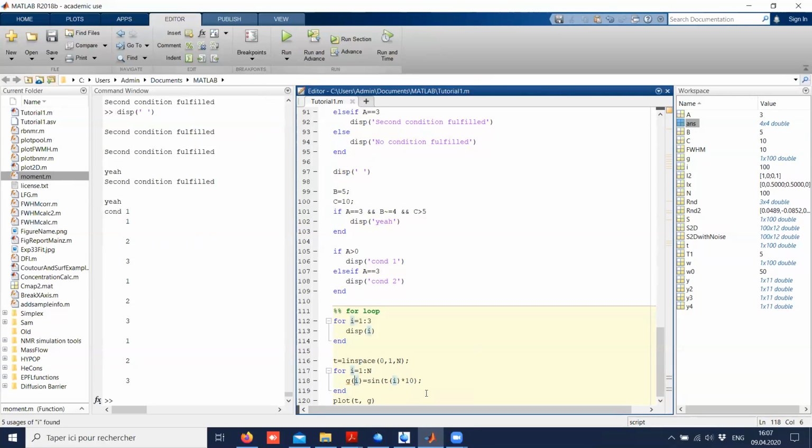So here, this is just to give you an example, because there are two reasons why this is an unclever way to make a calculation. First, I'm using G here, and there's a message: the variable G appears to change size on every loop iteration within a script. Consider pre-allocating for speed. So pre-allocating would be to give G the size it will have in the end.